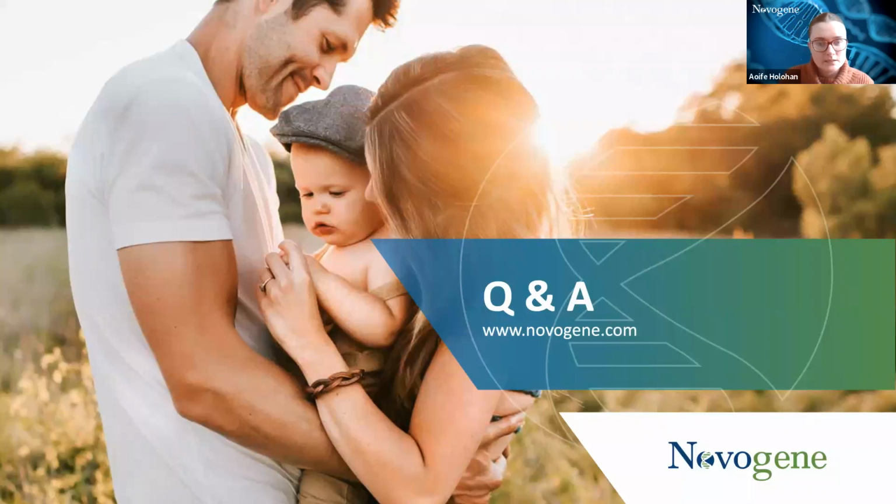Next question is from Ina asking, can I also perform the characterization analysis of RNA-seq on NovoMagic? Yeah, it's still a pity that it's a no so far, since, as I mentioned, the resources and also the storage required for the characterization analysis limit its availability, since we need to start the analysis from the BAM file, which is much bigger after the mapping.